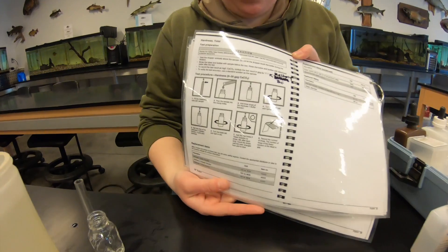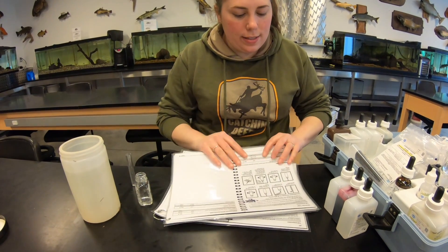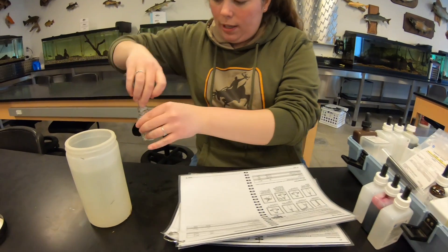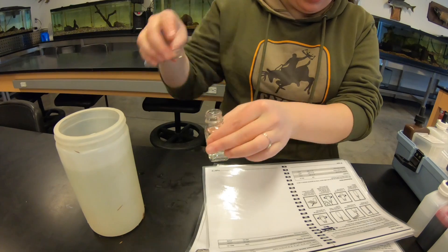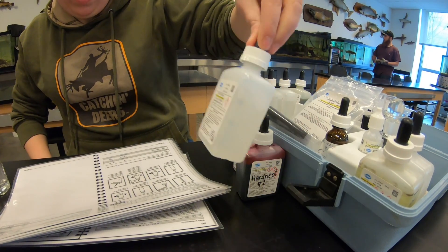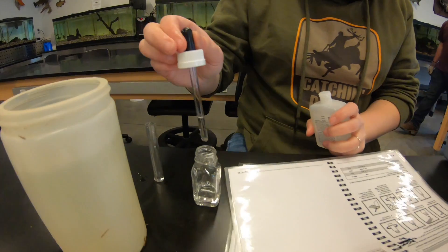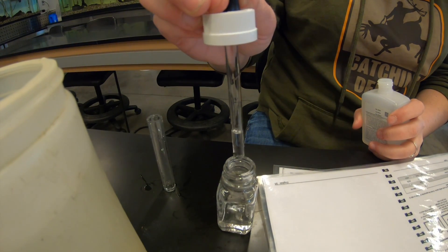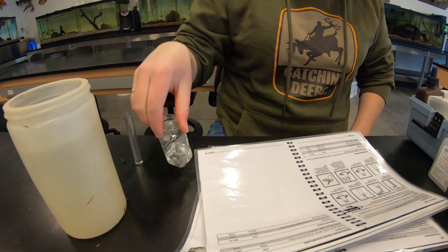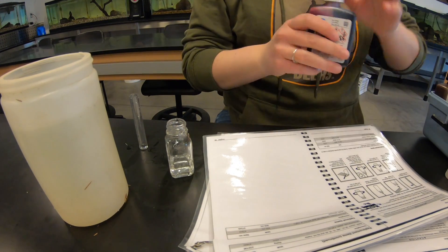Now we're going to do hardness - again cookbook chemistry from the Fish Farmer kit packet. I did rinse this out with some stream water. The procedure says to fill the measuring tube to the top and pour it into the mixing bottle. Then add three drops of hardness 1 buffer solution. Here we have hardness one, hardness two, and hardness three. Holding the dropper straight up and down - one, two, three drops - close it up and mix left and right.